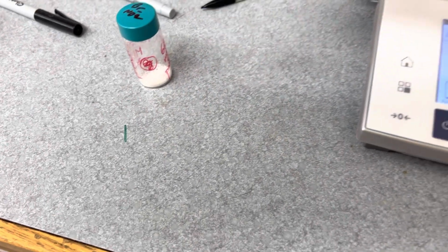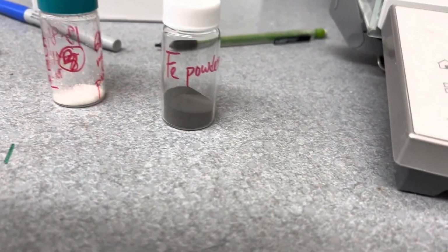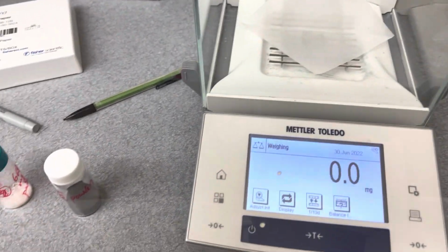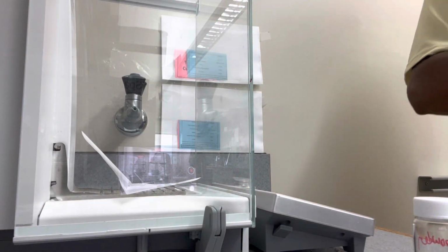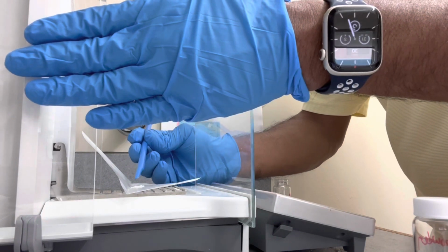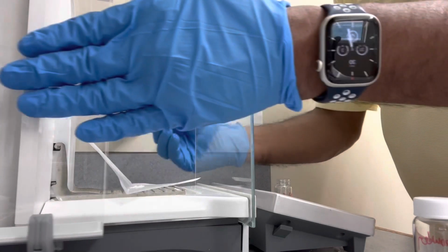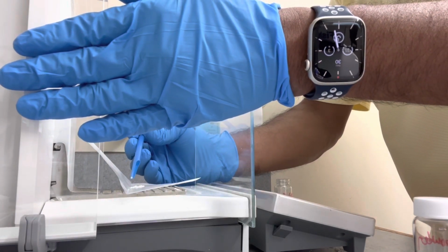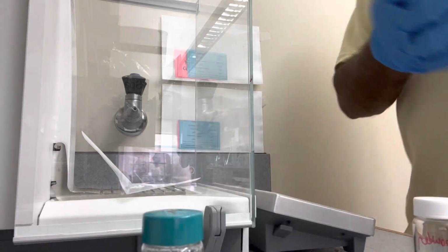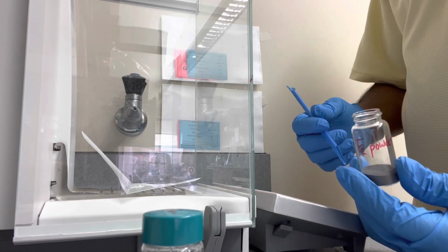Here I have the nitro compound and iron. The reaction setup is very simple. I'm measuring the required amount of my nitro compound and the iron. So I'm gonna show how to set up this reaction. This will be a small scale reaction, so I'm measuring a very small quantity. Although I have done this reaction many times before, now I need a small amount, so I'm showing a small scale reaction. Here I have taken my bromo compound. Now I'm gonna take the iron powder.